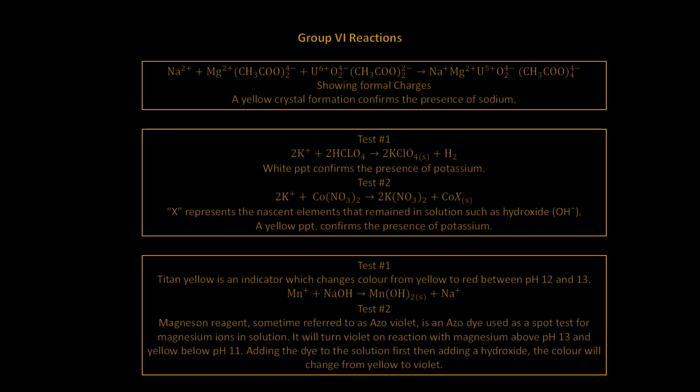A word of caution here. Uranyl acetate is formed from depleted uranium. It is toxic and targets the liver and your kidneys. Do not inhale or ingest. Use appropriate personal protective equipment when handling magnesium uranyl acetate.